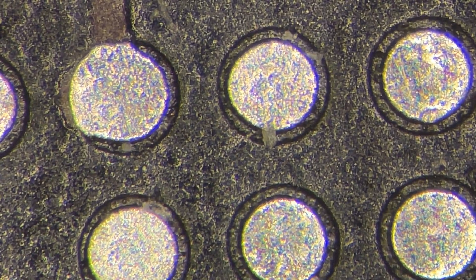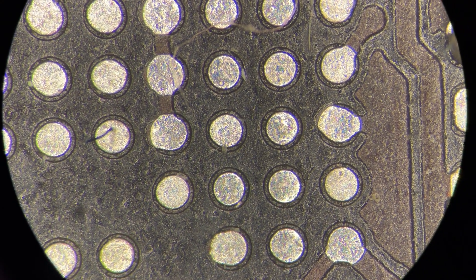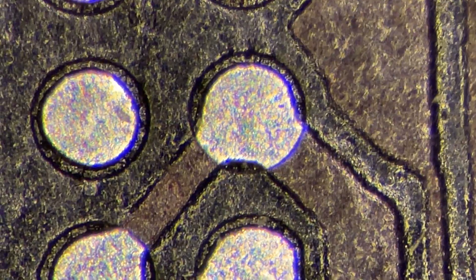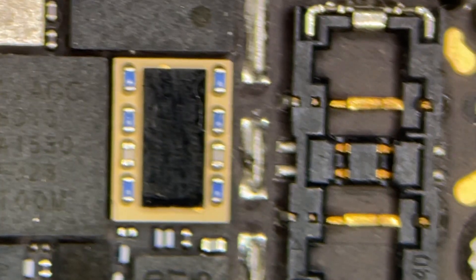I suppose it's a very familiar part of the board for most of you. Let's move over it a bit and make a little magnification. You can easily see chromatic aberration — it's not that much in our case, but you can see some parts of the resolution as well. I guess we won't see anything more interesting here.